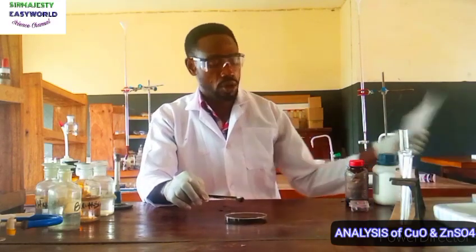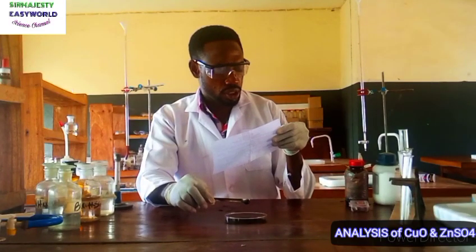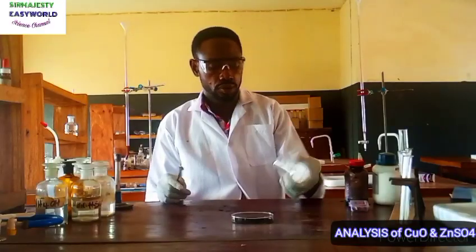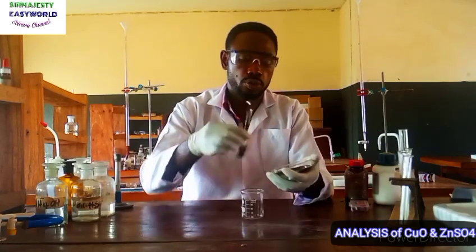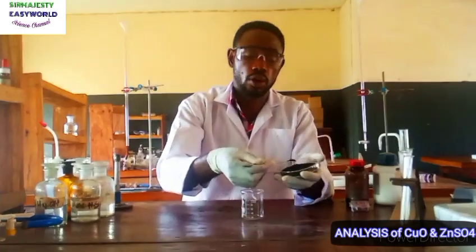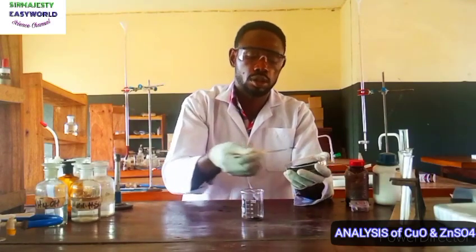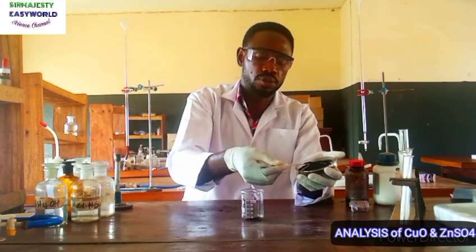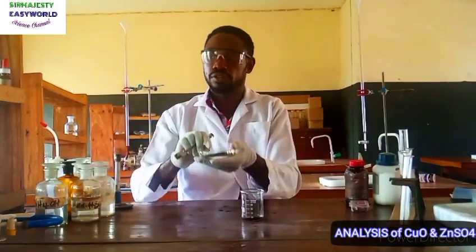So we get our question guide and see the instruction first. They say put all of G in a beaker and add about 10 ml of distilled water. So this is my beaker. This sample is too much. I won't be analyzing the whole because if it is in exam, one student cannot get all this. It's too much. I'll just scoop small. A student will get only 2 spatula full or 1 spatula at the maximum. So this is enough.